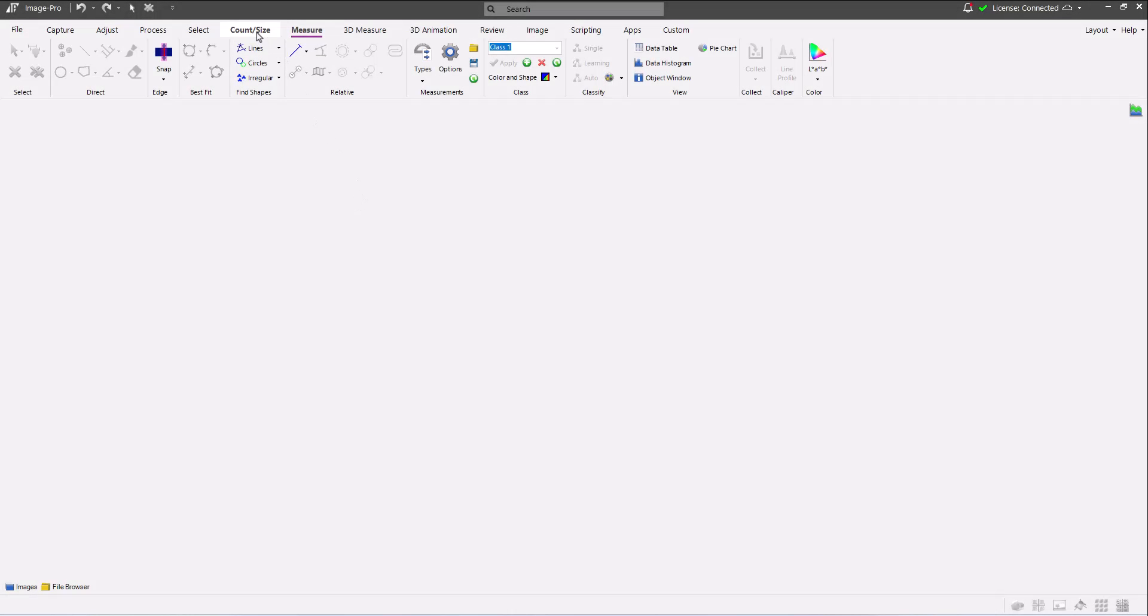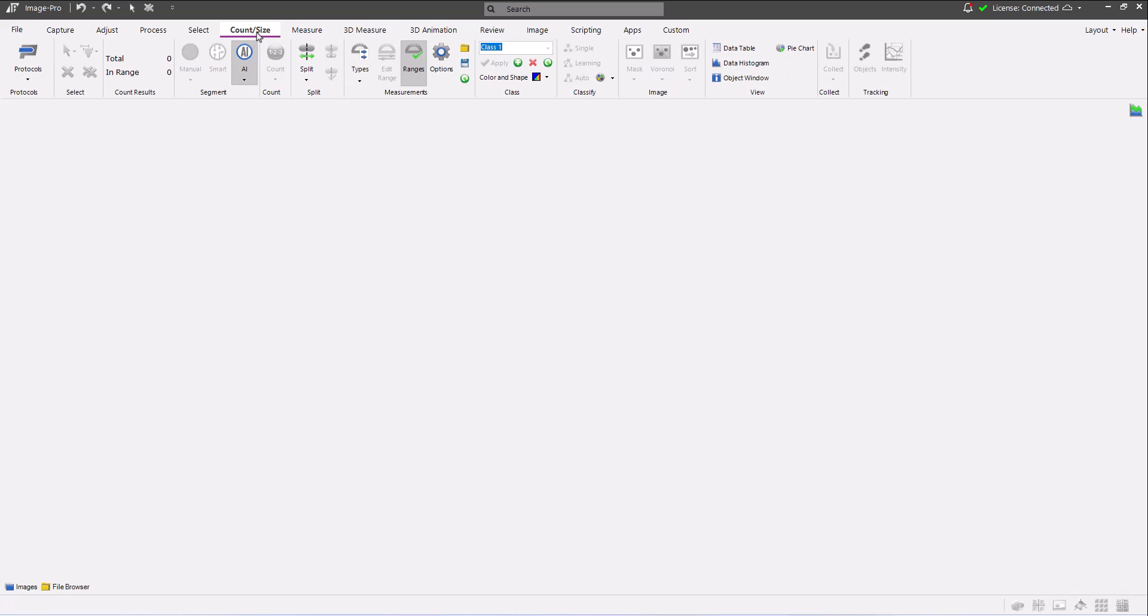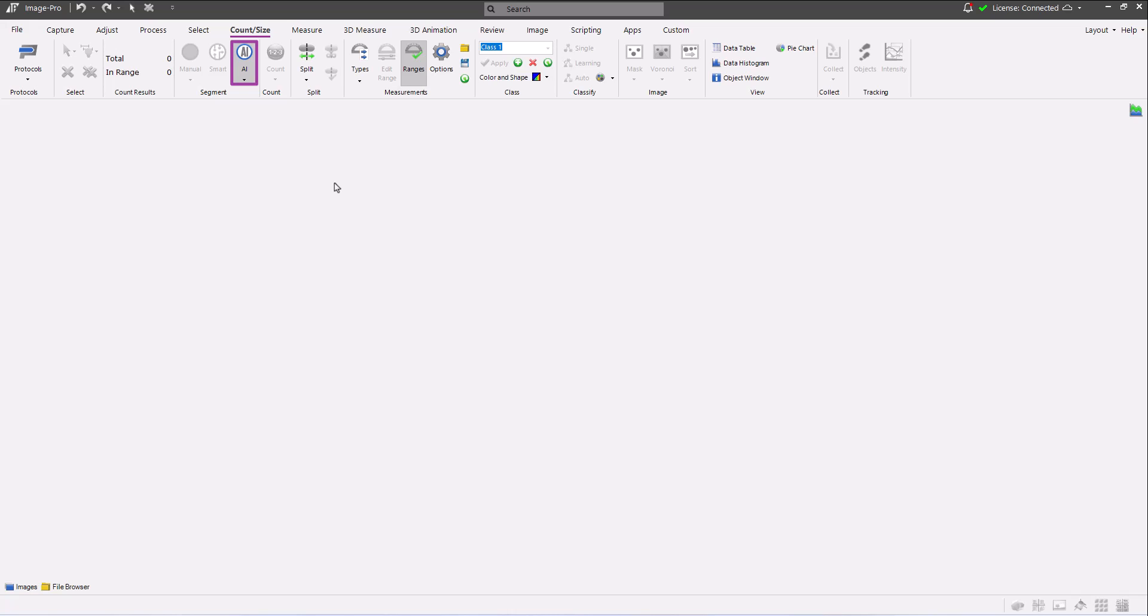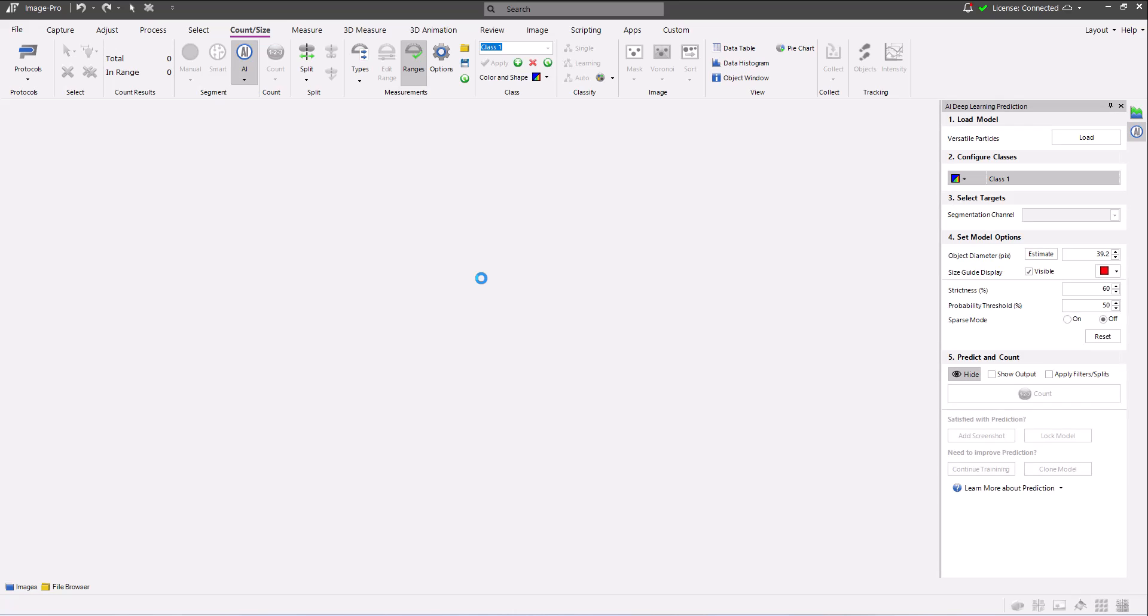First, let's select the count size ribbon. In the segmentation tool group, there's a new AI deep learning segmentation button. Click this button to load the AI deep learning segmentation panel.